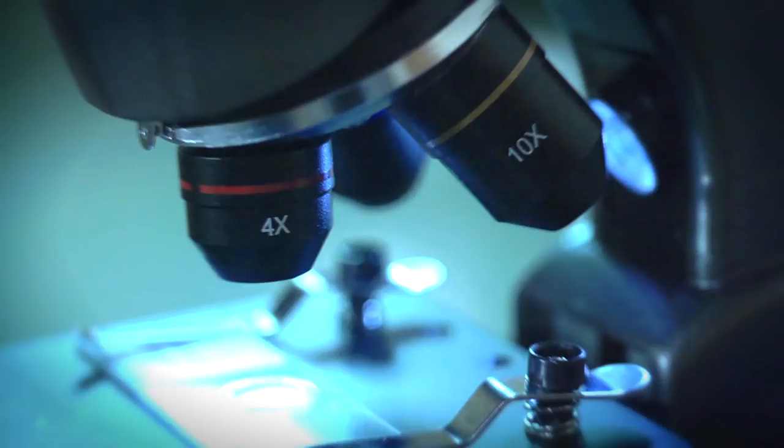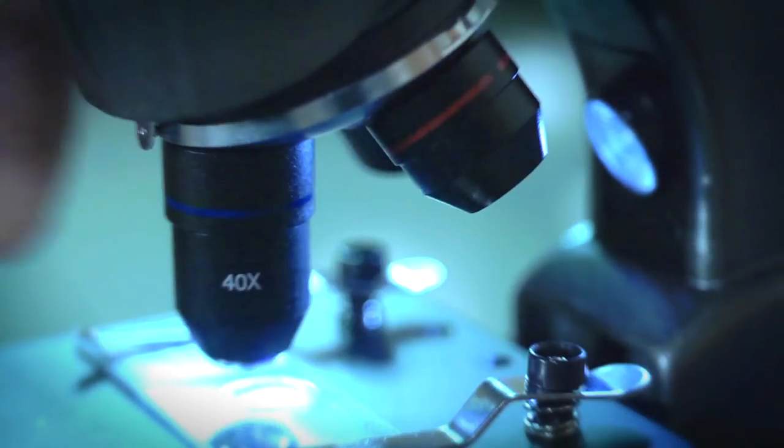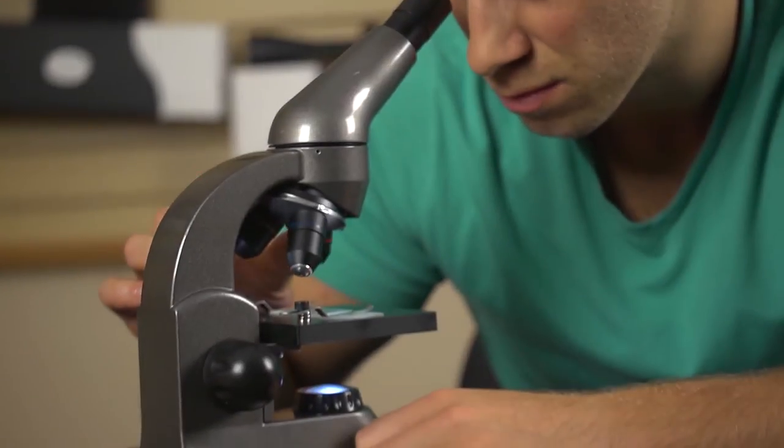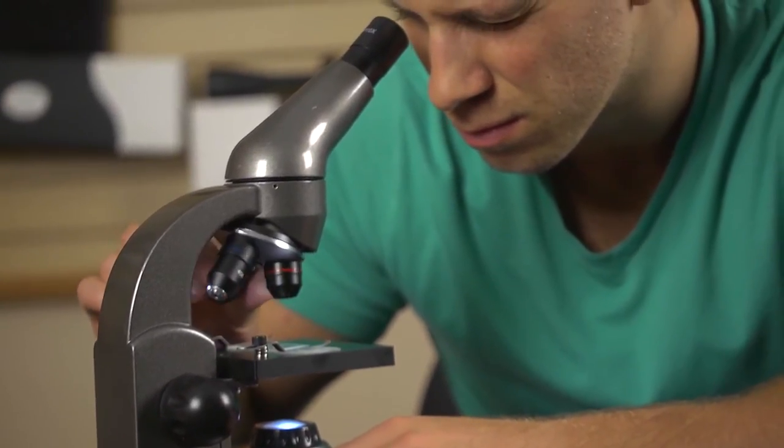The lenses we've included have a power of 4, 10, and 40. But in order to know the overall magnification of a microscope, you need to multiply the power of the objective lens with the power of the eyepiece.